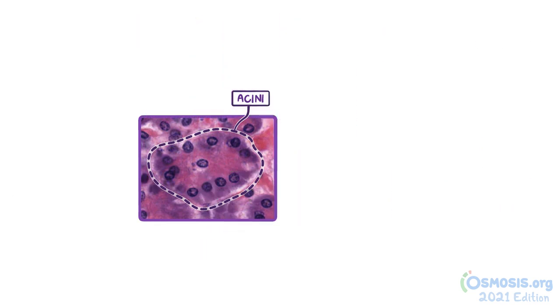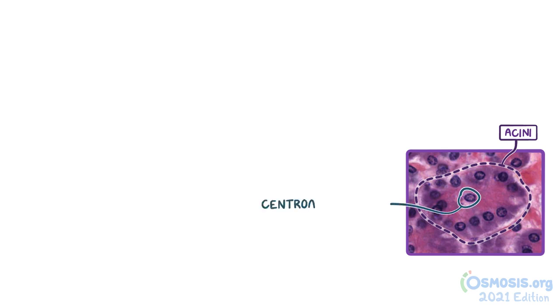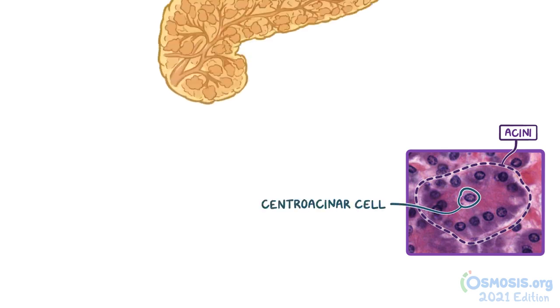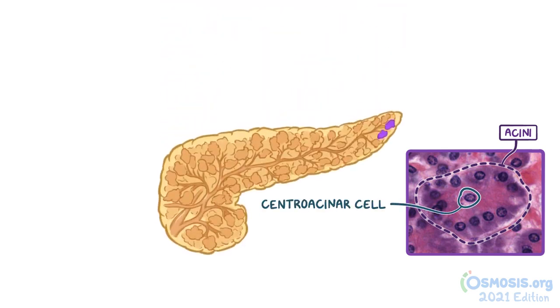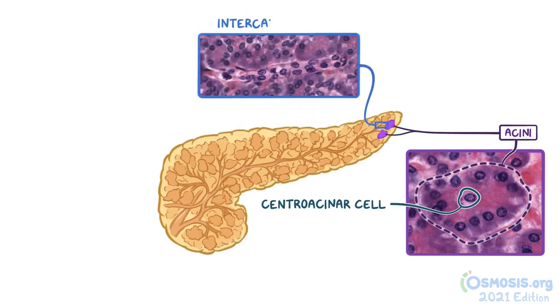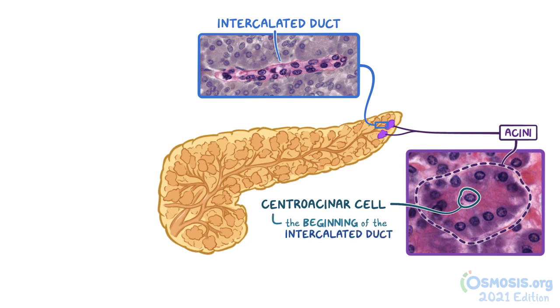The center of the acini will sometimes contain one or more cells with a paler appearance. These cells are called centroacinar cells, and they're actually extensions of the small ducts that drain the digestive enzymes produced by the acini, called intercalated ducts. The presence of centroacinar cells is a unique feature of the exocrine pancreas, and is also an identifying marker that indicates the beginning of the intercalated ducts.